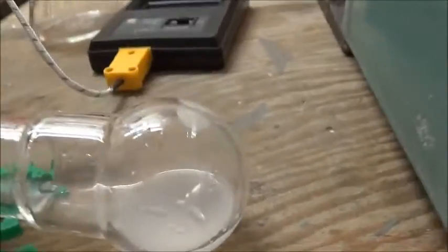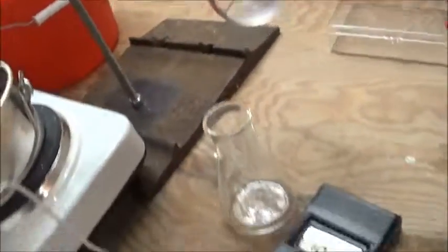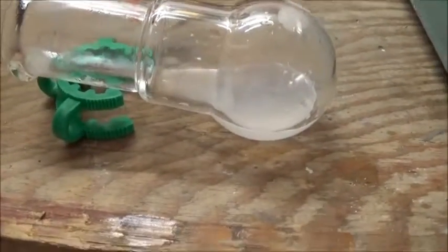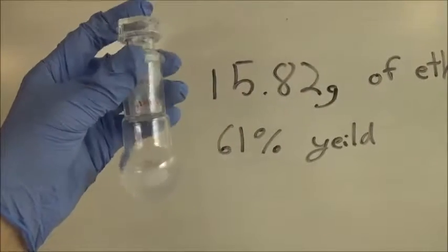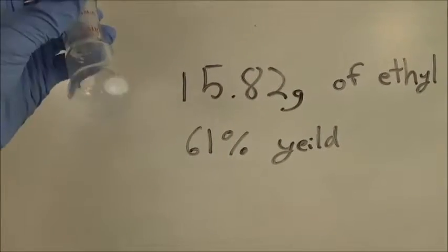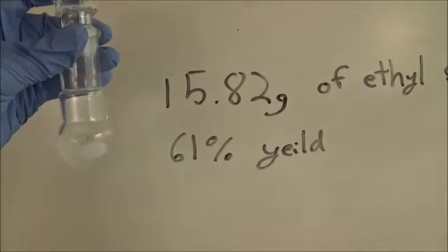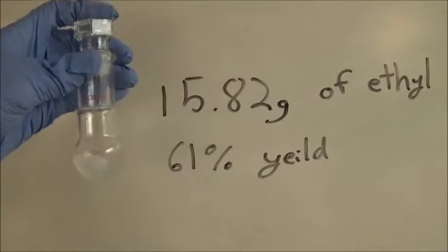The first material that came over was slightly cloudy because of a small amount of water — there was a fog on the joint — but it's probably not significant and I'll likely just dry it again. Here's the product of about five hours of work: 15.82 grams of ethyl salicylate, which corresponds to a 61% yield. 61% is kind of disappointing, but it is a lot better than the less than 50% yield I got last time. It's slightly cloudy, but that's not much of a problem.